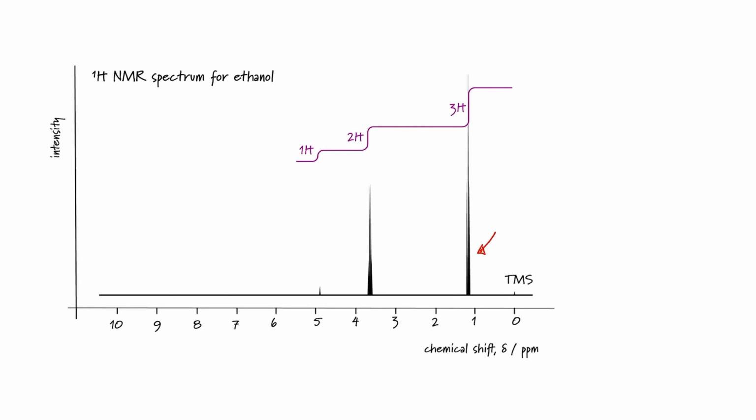Now, on a professional NMR spectrum, this information is summarized in the form of an integration curve, which is worked out by the computer and printed on our spectrum. As I said, at A level, the relative number of protons in each environment is simply written next to the peak.